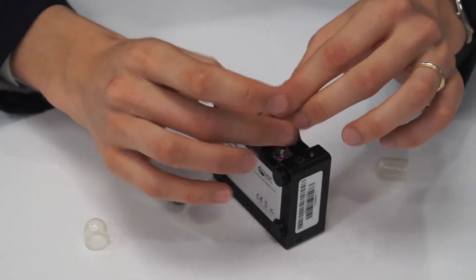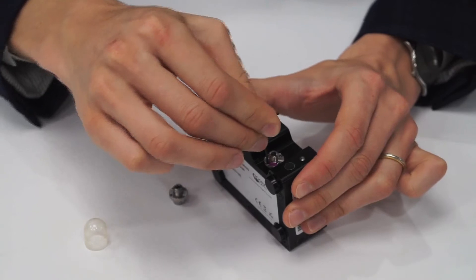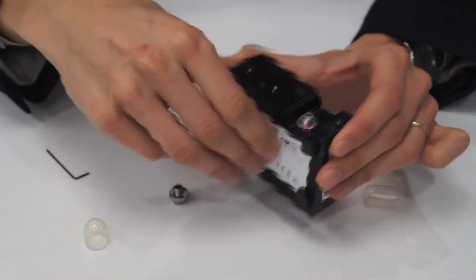Switching the slit is as simple as removing two screws and replacing with the new slit assembly. This allows you to optimise the spectrometer for your specific measurement in situ.